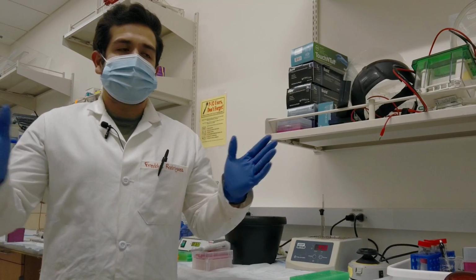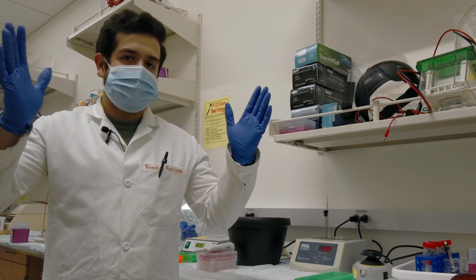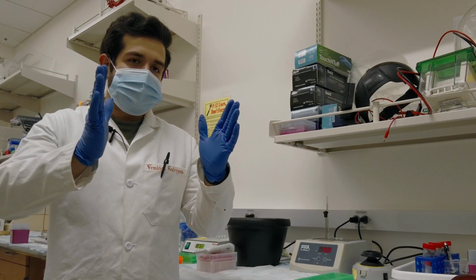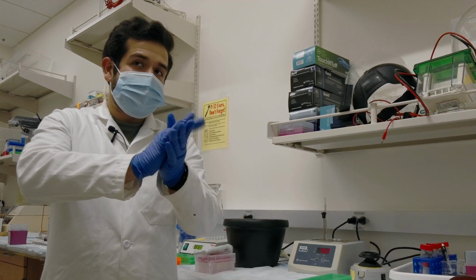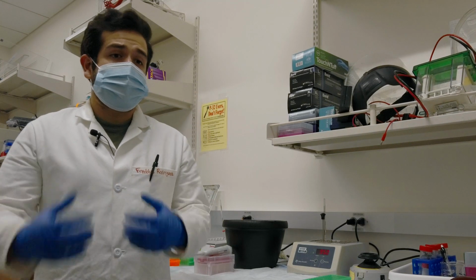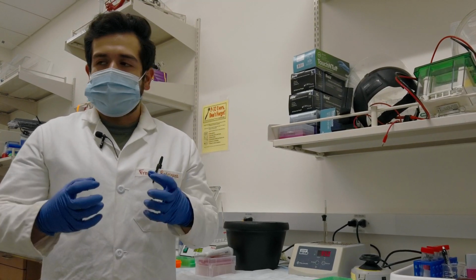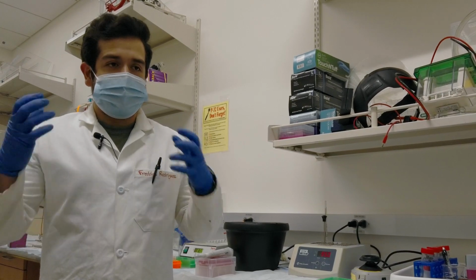So basically what you're doing here is that you're allowing these DNAs to float into solution, and as the solution cools, they will in space meet each other and anneal and make primer template duplexes, which is what you need in order to run these kinds of experiments, as polymerases recognize this double-stranded DNA.